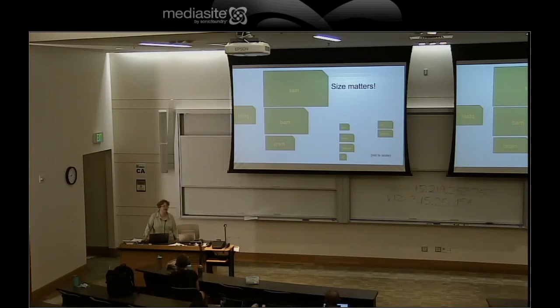We add layers of compression by just taking the information we want out of the file. So all of these formats over here, bed, bigwig, bedgraph, and TDF, are all just parts of the data. SAM and BAM are going to have every read, every map, every mismatch. But when I want just the regions, like in ChIP-seq, I can go to a bed file. When I want just the histogram of how many reads per position, I can go to a bigwig or a bedgraph, okay? So there are ways of making that data much smaller. When you get to a bed, bigwig, bedgraph, or TDF, those are small enough that they will fit on your computer.